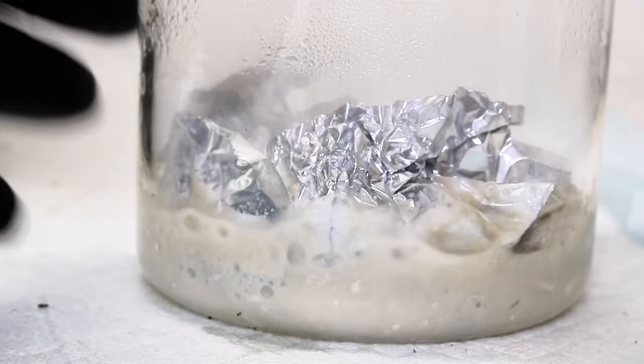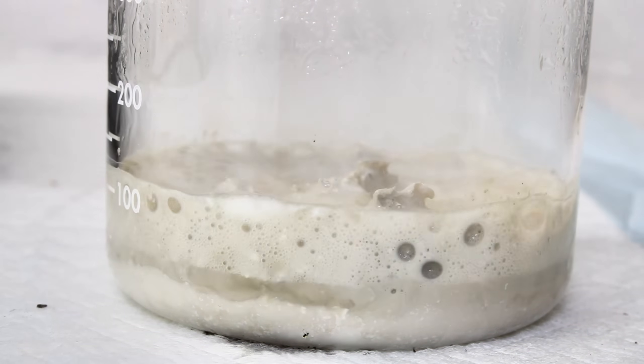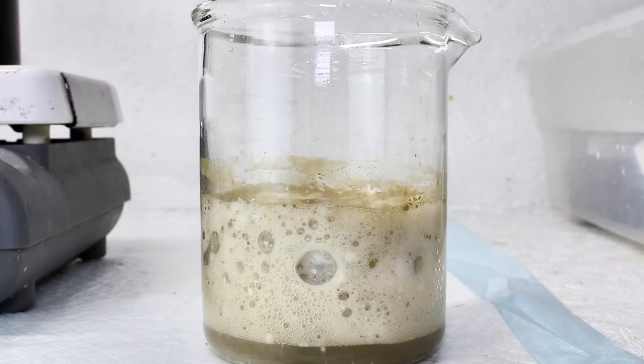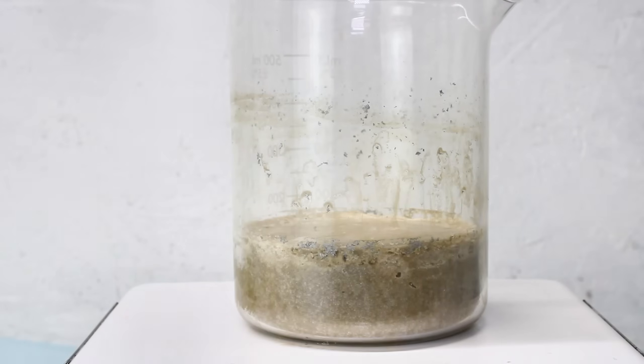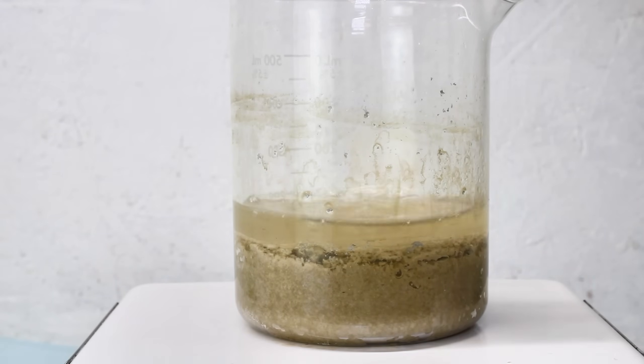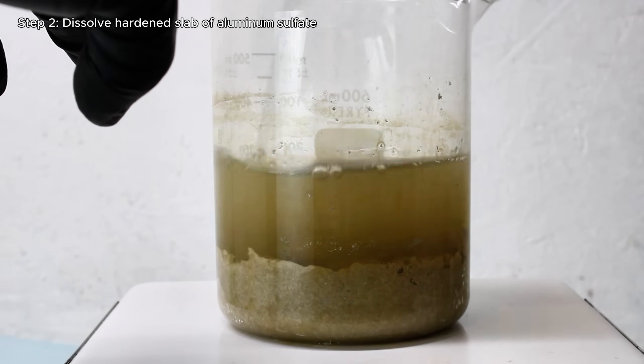To get started with method number two, I simply added some concentrated sulfuric acid to a beaker along with some aluminum foil. Sulfuric acid won't begin to dissolve the metal until a bit of water is added, but the second water is added, the two react very very aggressively. This produces a lot more foaming than the hydroxide did, as well as a lot of brown discoloration. I went ahead and kept adding water and aluminum foil until no more would dissolve and then left it overnight.